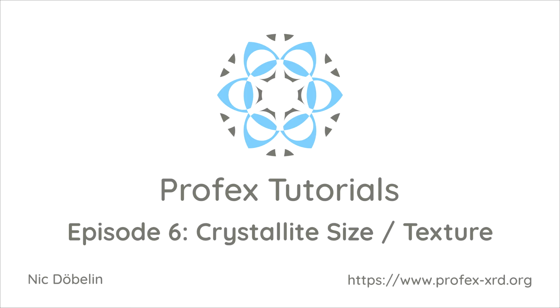In this video I'm going to explain in more detail how we can refine the crystallite size and texture if this is something we observe in our datasets. We briefly addressed these parameters in a previous episode, but I want to give some more background information so you really understand what we are doing.